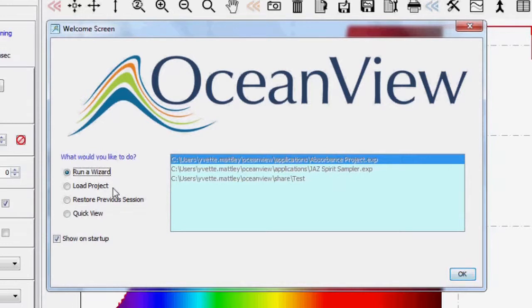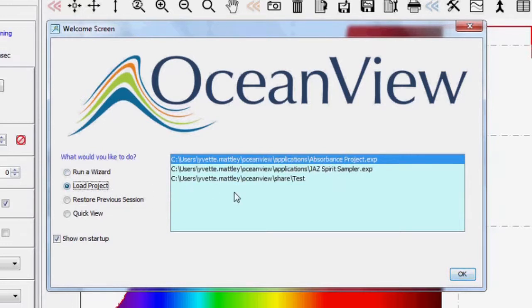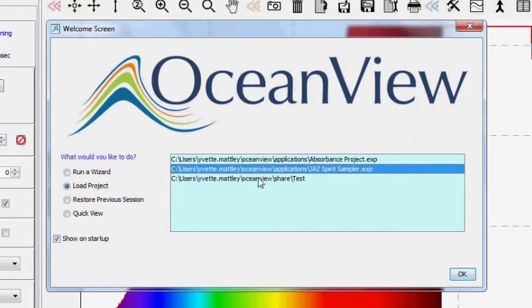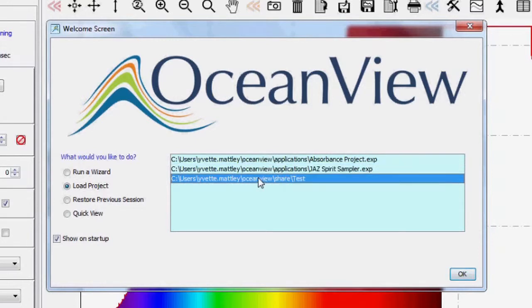Select the Load Project option to see a list of the available projects that will enable you to skip the wizards and start your measurements in your preferred measurement mode.